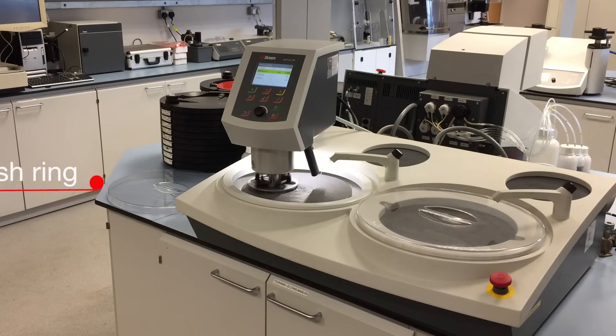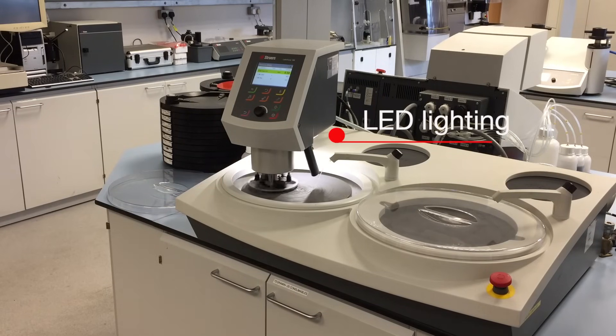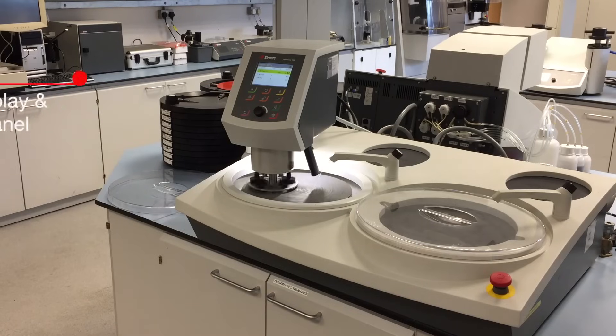The splash ring limits the dirt and provides safety. A long light LED lamp illuminates the preparation area to give you a clear view. The front display shows you whereabouts you're on the program and how long remains.